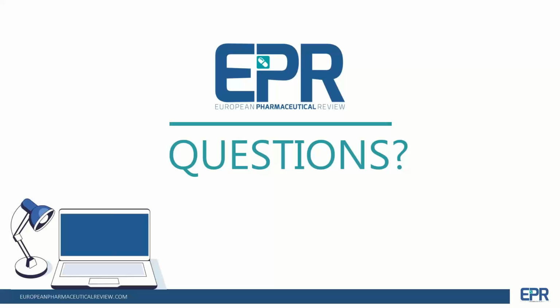Perfect. Our next question that's come in is, can different tablet sizes or shapes be measured? Yes, they can. The tablet holders, as I've shown you, the oblong one can fit different sizes, but we also have different size holders that can be used. So yes, they can be. It's advisable that within one calibration model, the same dimension of tablets be used, especially the same thickness.